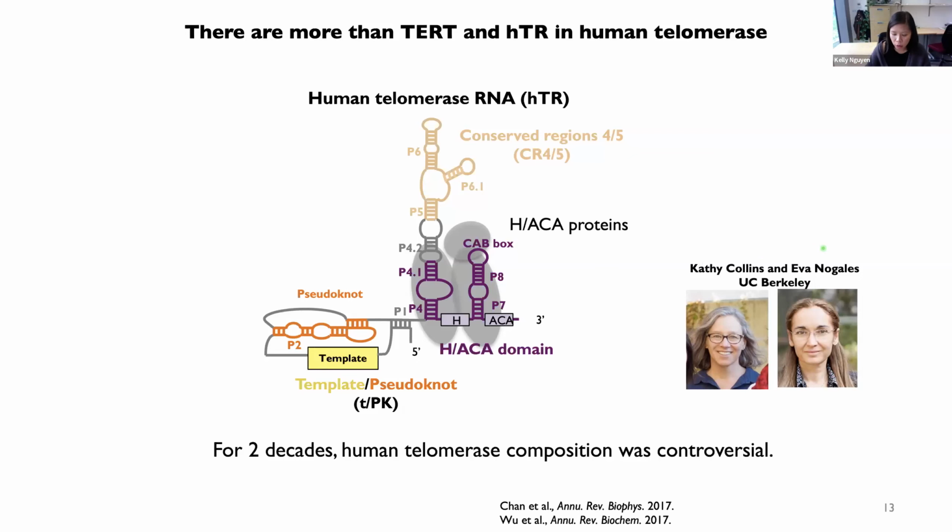So this is where the project started. Telomerase, as I mentioned briefly, is absent in most cells, and it's actually one of the very rarest enzymes in the cell. The first challenge to studying this structurally is to reconstitute and purify it to a quantity that one can think of for structural studies. And that's the first major step forward that I made when I was a postdoc in Kathy and Eva's lab: to devise this reconstitution.